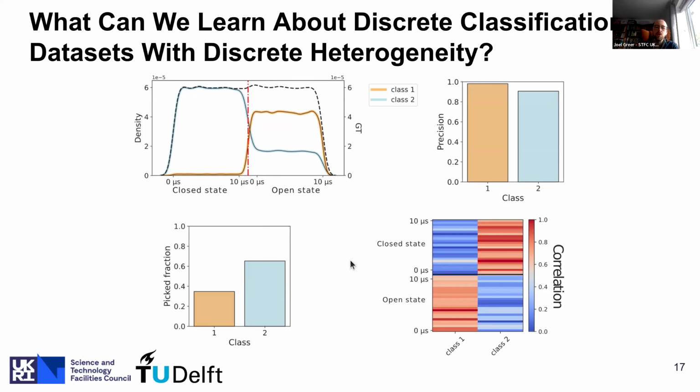But what we also want to figure out is which class, remember each has a reconstructed density map, which of these reconstructed density maps is most similar to the actual atomic models from the open state and the closed state MD simulations. To do this, we computed the real space map to model correlation between atomic models sampled from the open and sampled from the closed state MD simulations, so 50 from each.